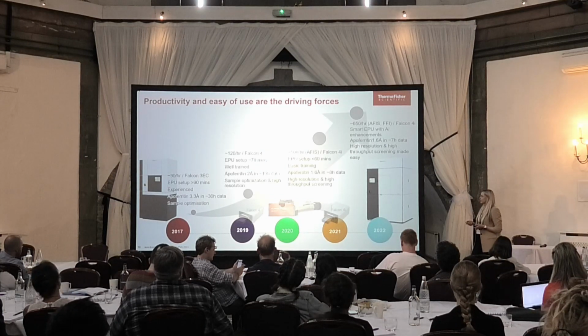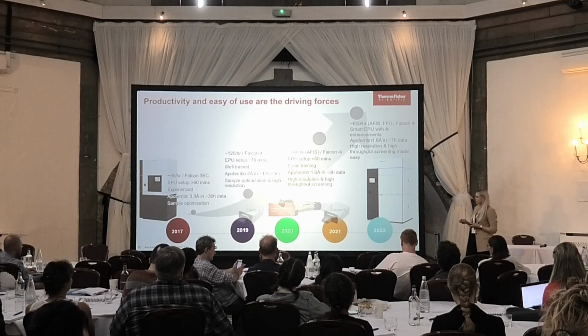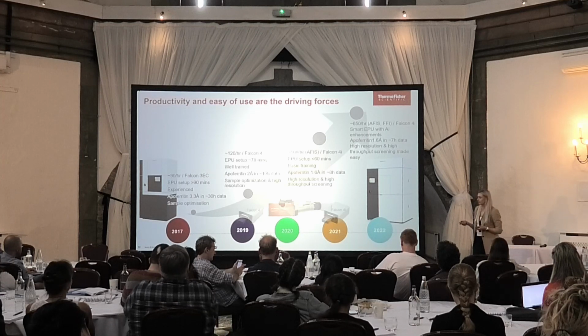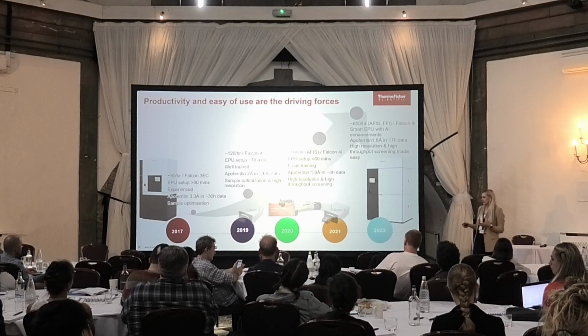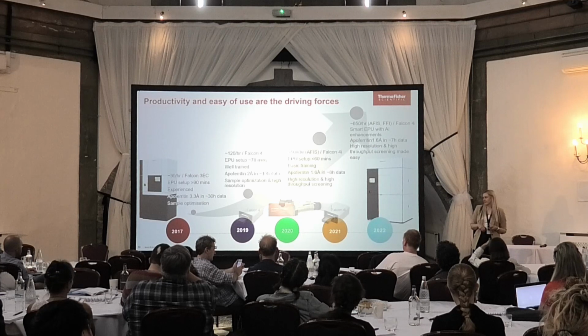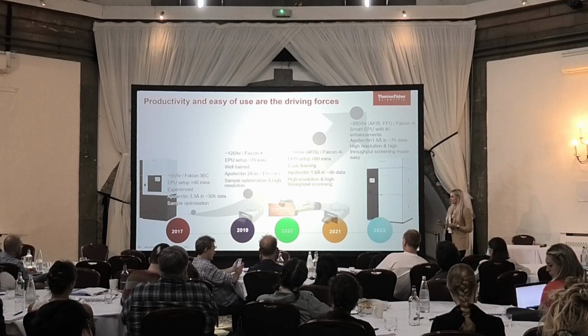And I want to use one example. So I want to use a Glacios microscope. When I joined Thermo Fisher in 2018, we had the very first Glacios that was ever manufactured installed in the nanoport, and we're trying to collect data on various different samples, collecting at 25 images per hour, perhaps 30 at the tops if we really push some things, and we're getting good structures.